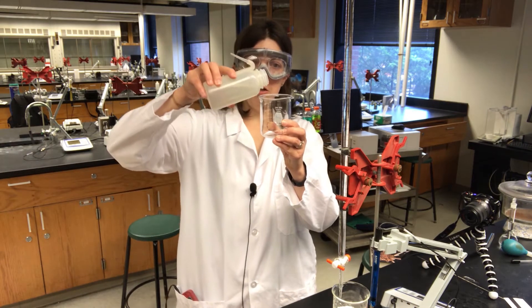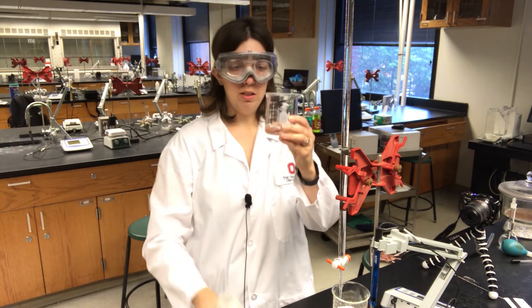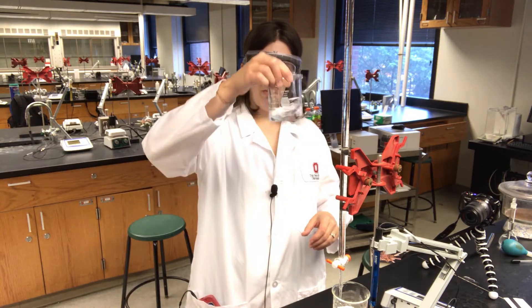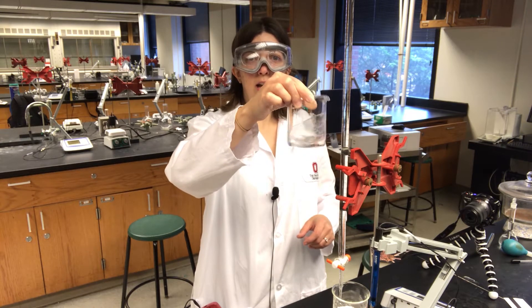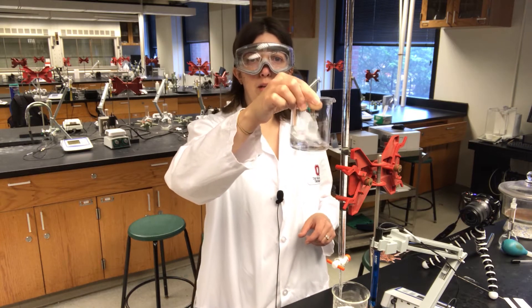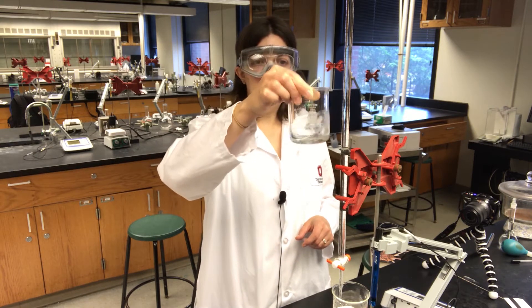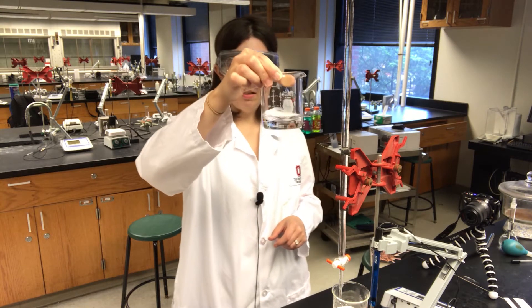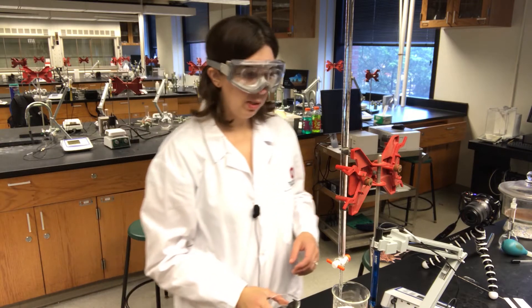Just like in our titration using an indicator to determine the end point, there's no need to actually measure the volume of water added — no need to be precise on that. You can just add a little bit of water from your wash bottle and then swirl to dissolve. This dissolves pretty quickly, which is nice; it's not always the case with weak acids.